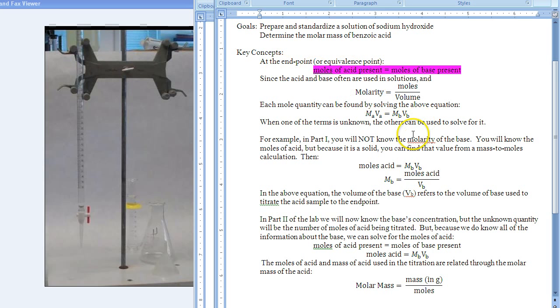So good luck in determining your concentration of your sodium hydroxide. Again, I really want to stress that you get an accurate or as accurate as possible value, since you'll use it next lab in determining the neutralizing power of an acid. And in that lab, your data point will become part of the class collection of data. So your contribution to the class will be very important, since you'll want to be able to contribute accurately to the overall data set that gets generated.